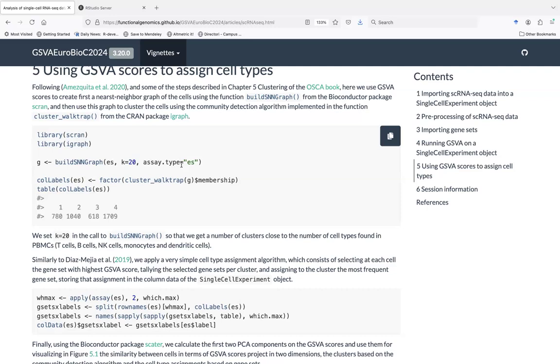Obviously, the data can be normalized, so does it have to be log CPM, or can it be any normalization in log scale? For example, rlog from DESeq2 or something like that. Yeah, exactly. Whatever makes the columns more or less comparable, that corrects the different sequencing depths of the samples, any normalization should work.